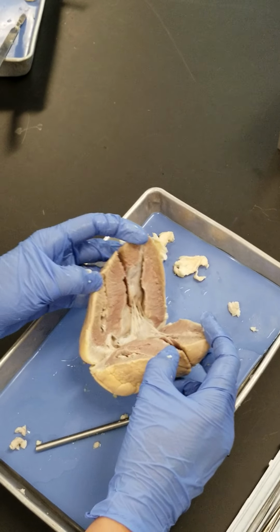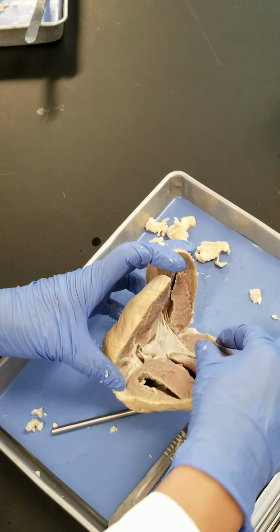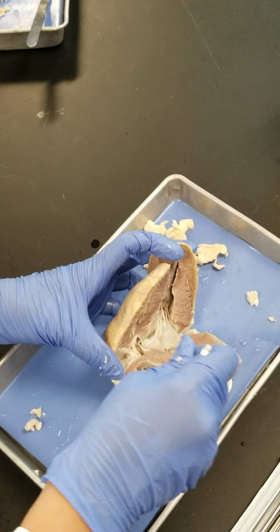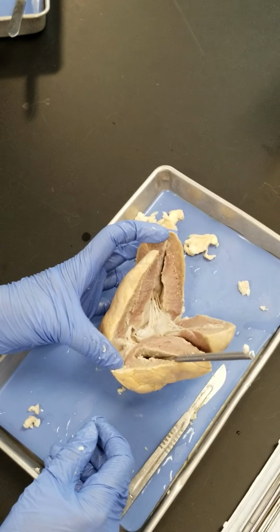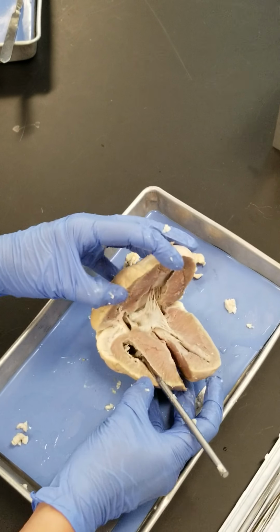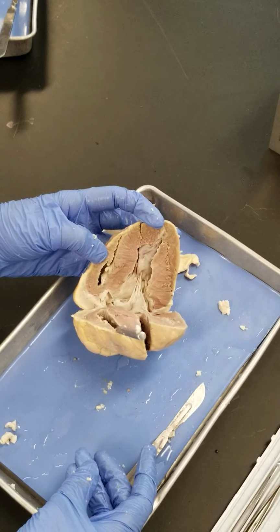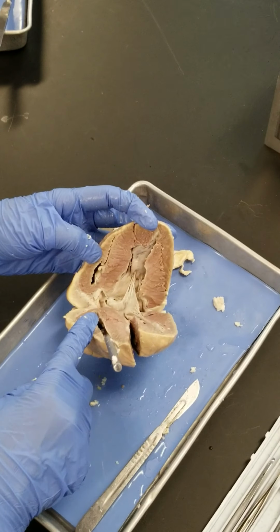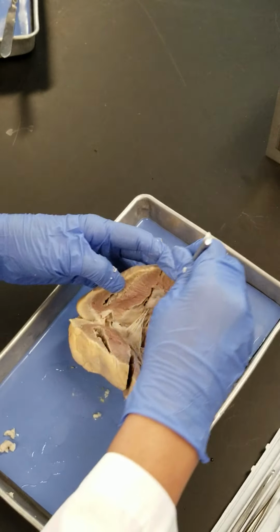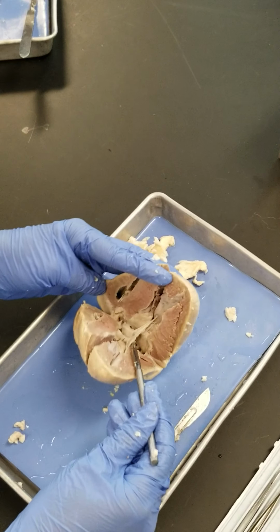You open the heart, the first thing that you search for is the thickness of the wall. This is thinner than this one. Therefore, you just go all the things backward. What chamber is this one? I put a pin here and ask you what chamber it is. It is? Right ventricle. Everybody agrees? What about this one? Left. Left ventricle.